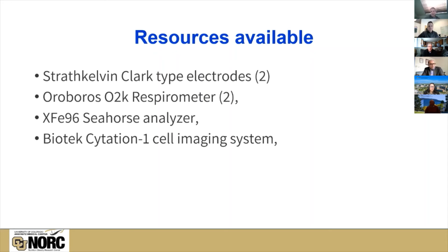He left for Oklahoma, it landed in our lap, and that's when we started the core. We also have the BioTek Citation 1 cell imaging system. This is a standalone system, and people use it for imaging, but it's also coupled to the Seahorse analyzer for normalization procedures.